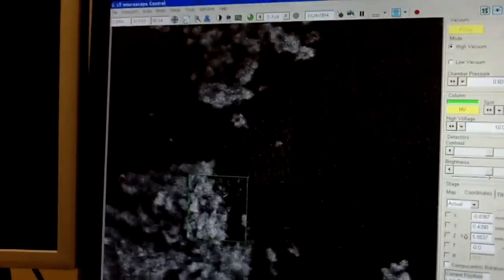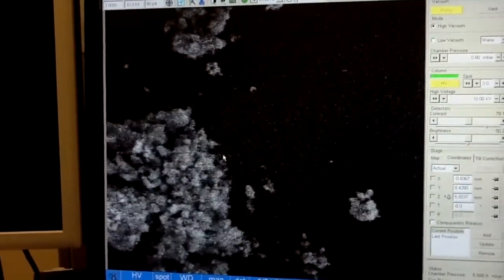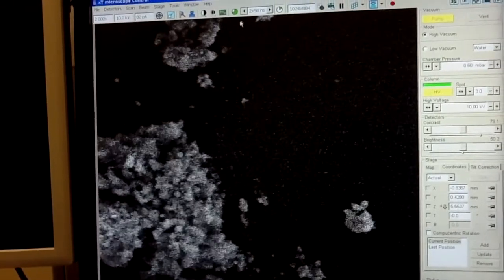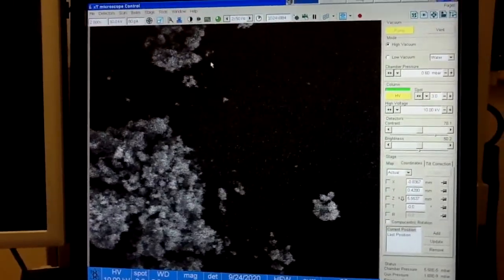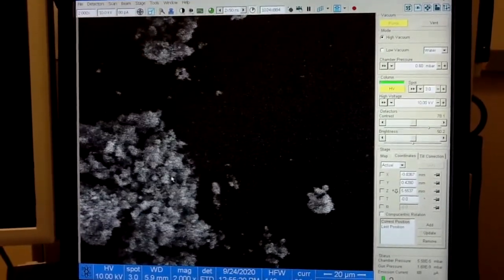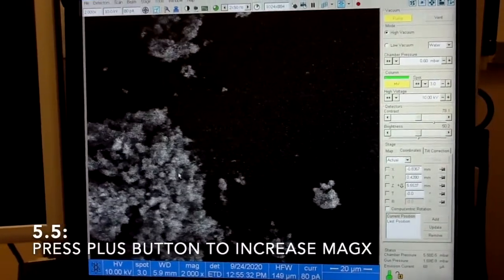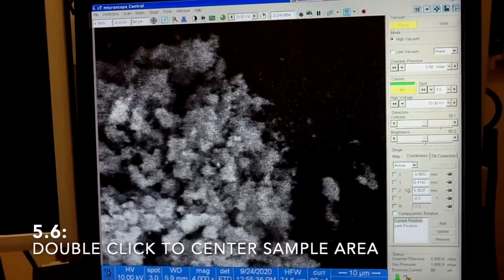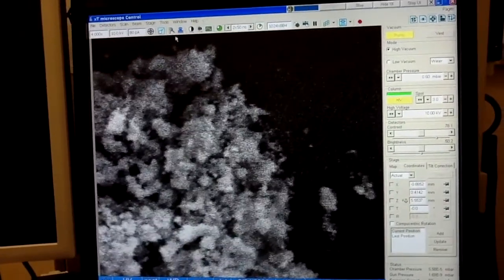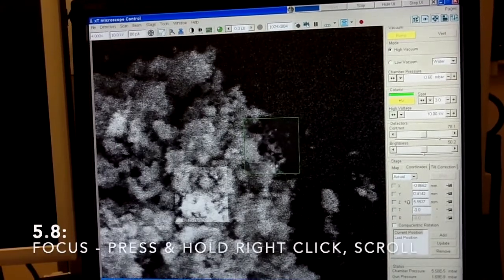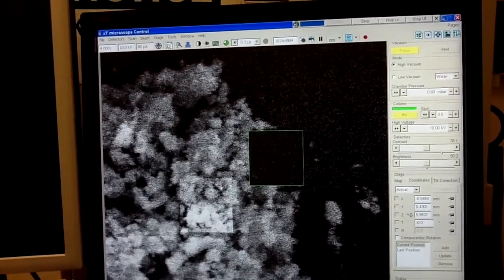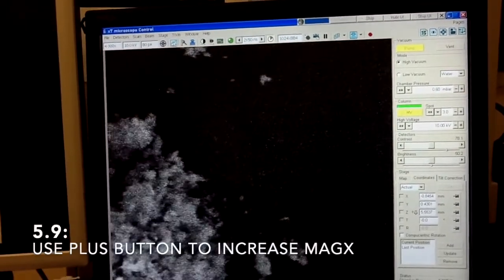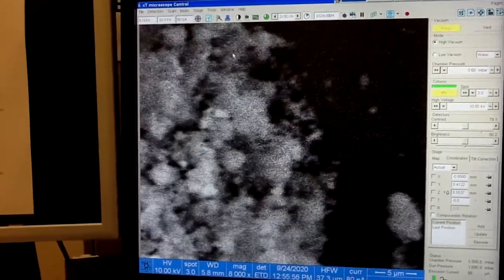Let's say right now. If you press this button again, you will see, of course, the live view of all this. And at this magnification, 2000x, you will probably get a decent image. However, if you go to higher magnification, if you press plus button on your keyboard, you can increase the magnification twice. For example, this is 4. The image starts to show some issues. Maybe at this magnification, we still don't see this. So, let's increase by additional factor of 2.